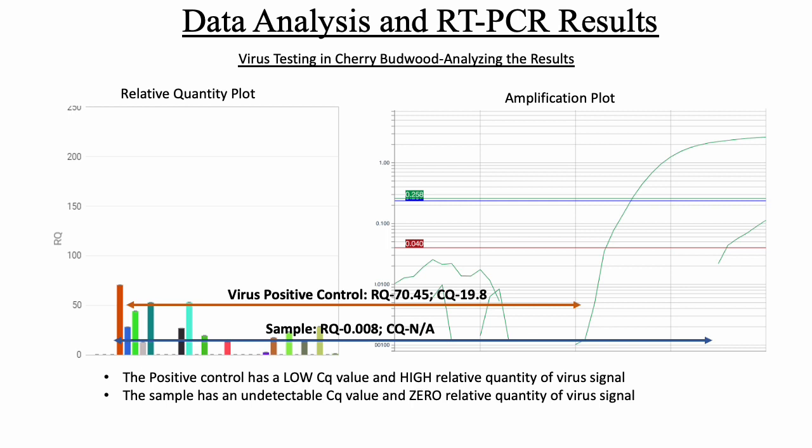Well, that's all the time I have, but I hope I have shown you how seriously we are taking the threat posed by little cherry disease by rigorously and routinely testing our budwood orchards using real-time PCR combined with virus-specific probes in order to provide pathogen-free trees to our growers.